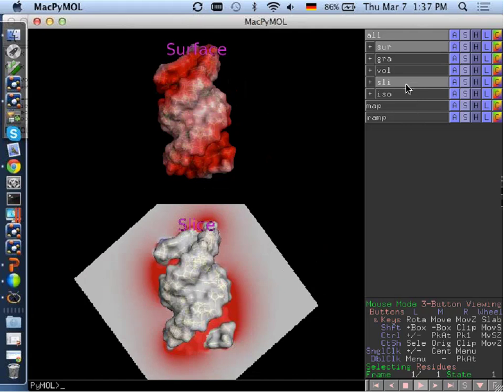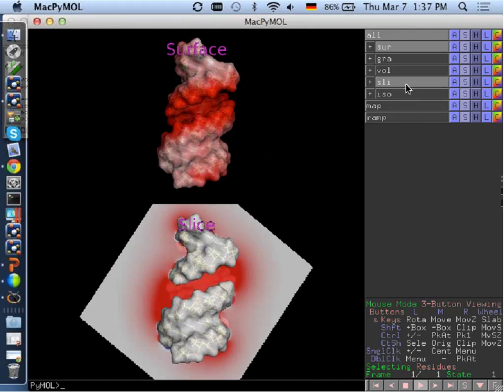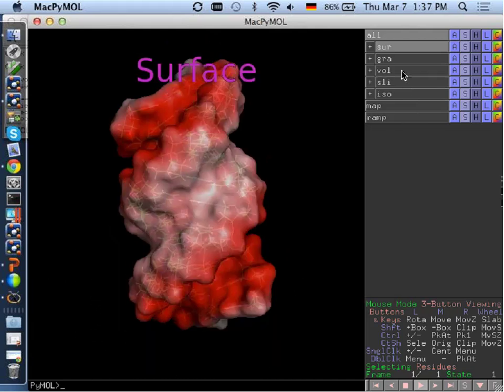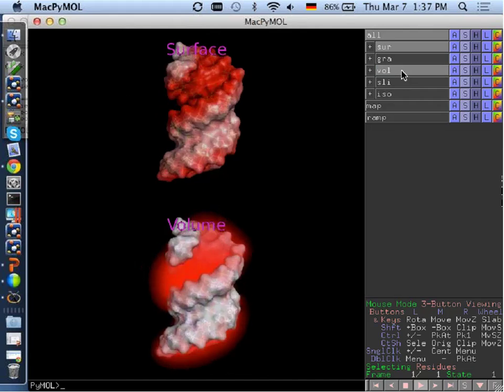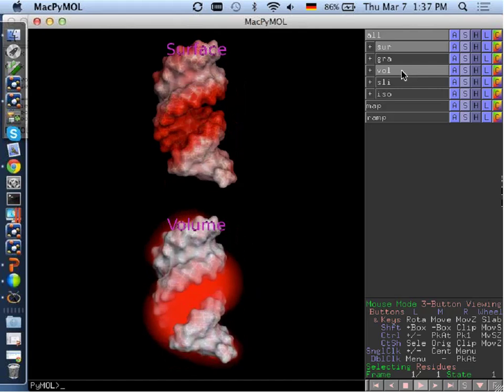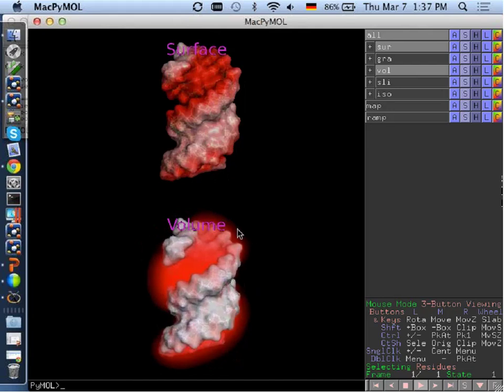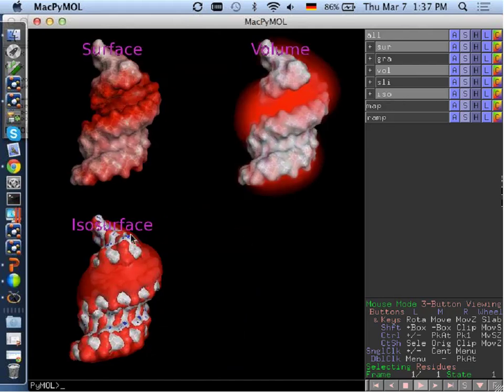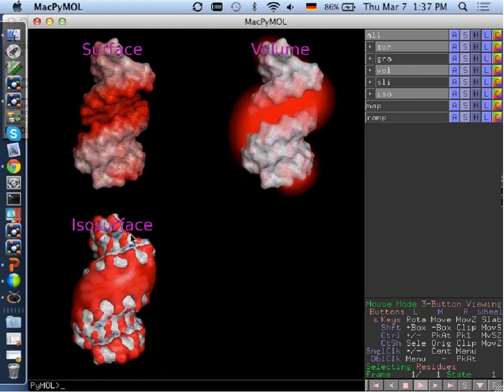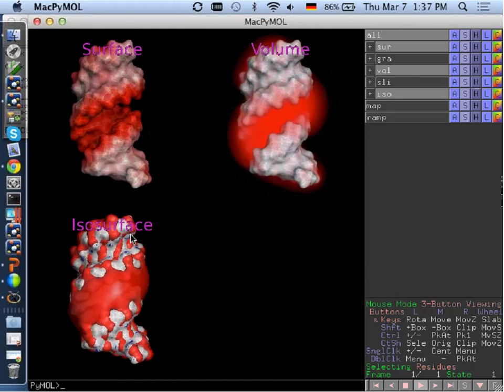Okay, so you already see the gradient on the plane, but you have to rotate to get the data in each direction. So the new volume rendering kind of combines features of both. It is the gradient in 3D space. It is transparent, so it doesn't look as solid as the isosurface. Let me show this. In comparison, the isosurface looks quite solid. The volume representation shows that it's really ranging in 3D space.